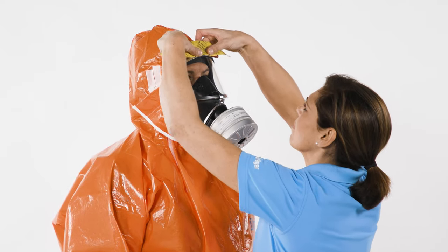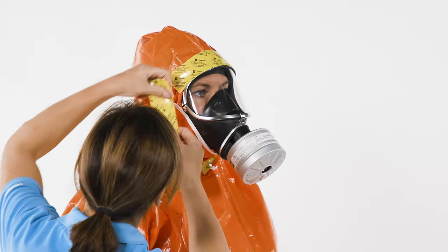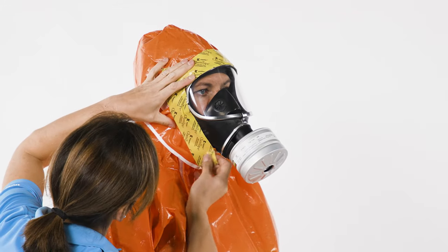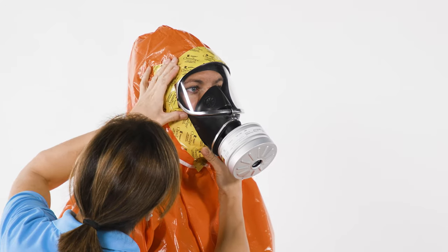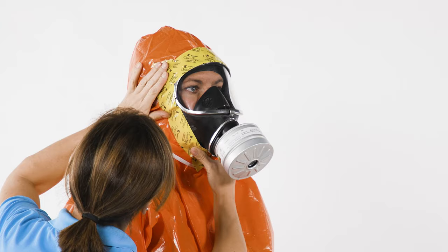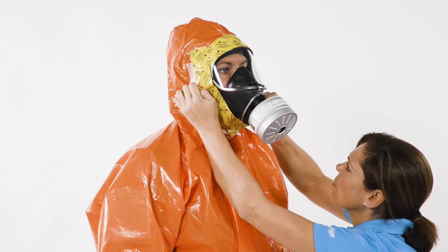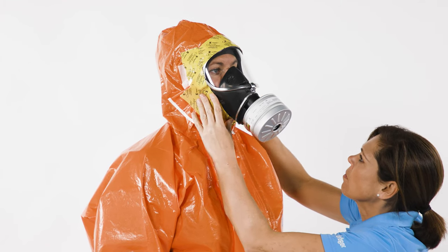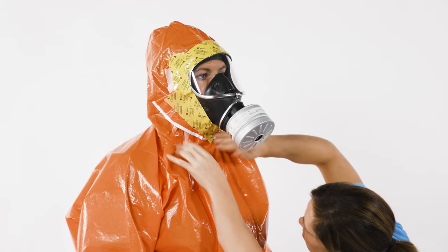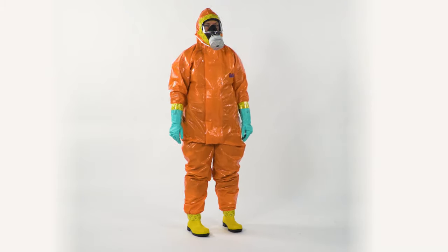Then tape the mask to the suit and also avoid wrinkles here. The suit is now ready for use.